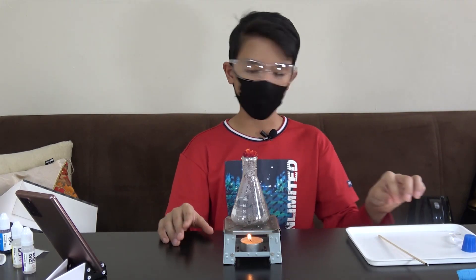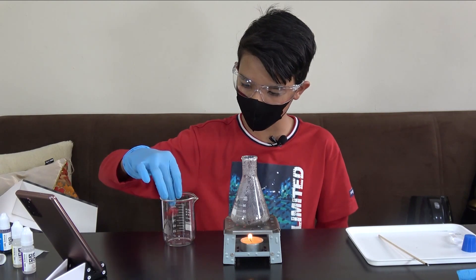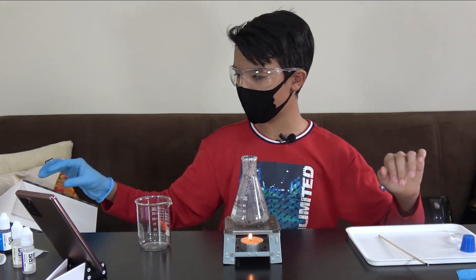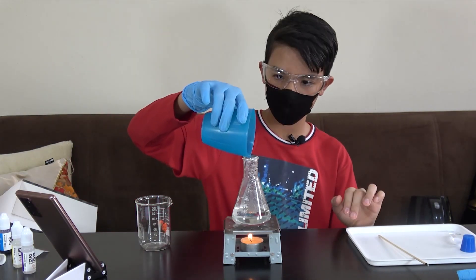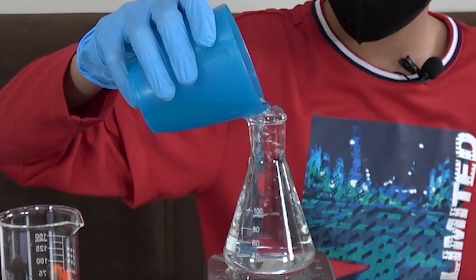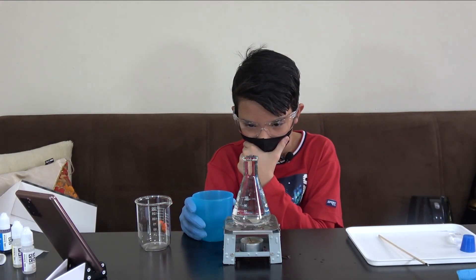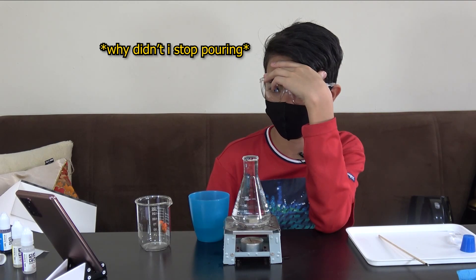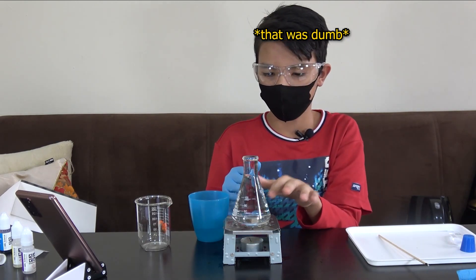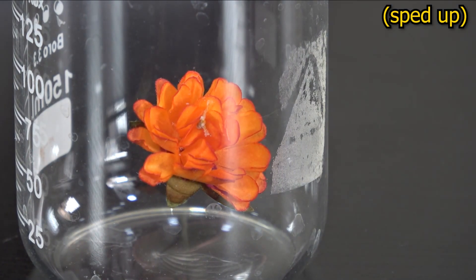The five minutes is up, and as you can see our flower turned red — that's pretty amazing, mashallah! Now I'll get some gloves and transfer the flower to the beaker, just like that. To stop the release of gas from the flask, I will pour some water in, and then I will extinguish the candle.